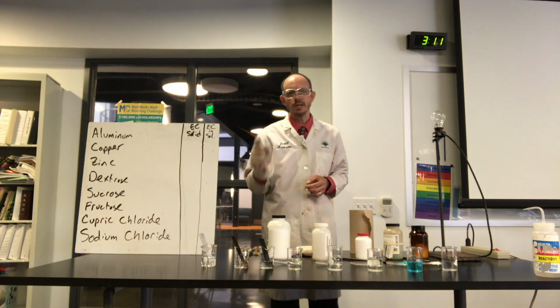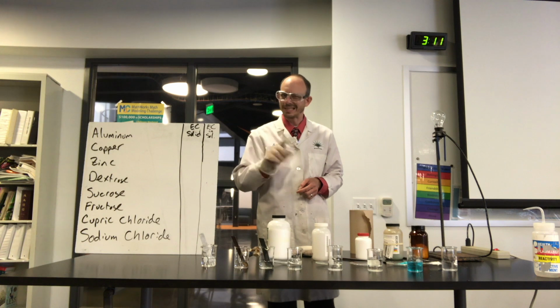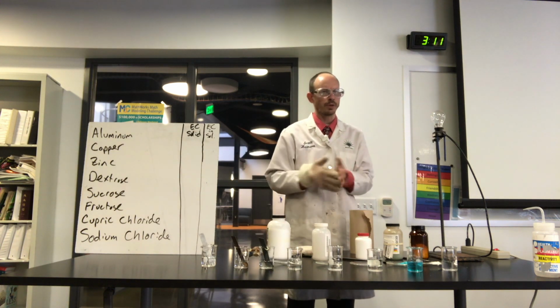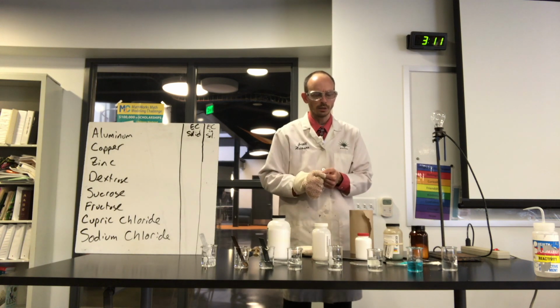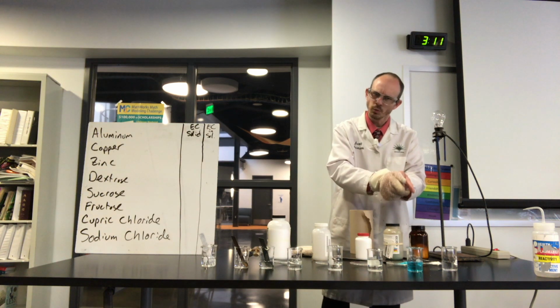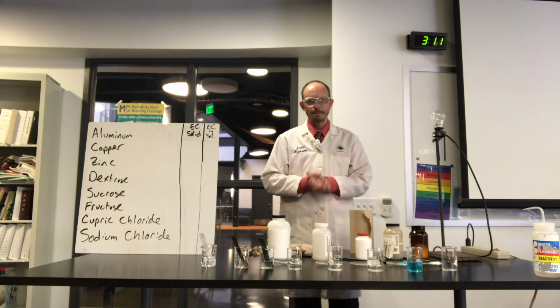So the metals conducted when they weren't in the water, but didn't conduct when they were. These 3 didn't conduct whether they were in water or not, yet they dissolved. And these 2 dissolved and conducted in solution, in water, but not when they were solid. I wonder why.